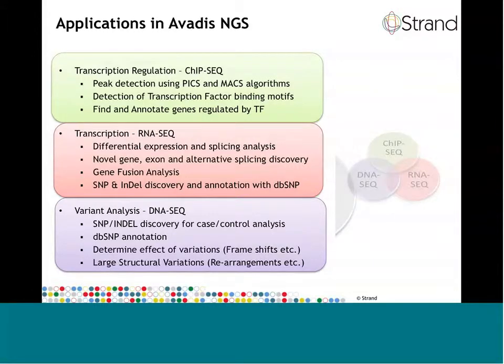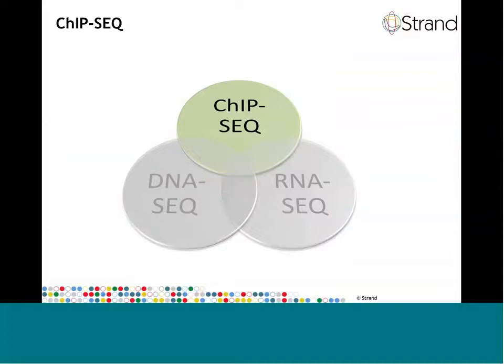So the next set of 7 slides will provide you with some more detail on the ChIP-Seq workflow of Avadis NGS.